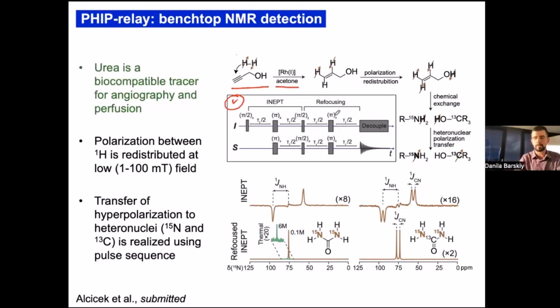After preparation of your target hyperpolarization, you can use phase transitions such as precipitation of your sample, degassing of your sample, or adding some extra solvents to solidify some of the materials and leave other chemicals intact. Then you can clean the solution if the lifetime of polarization in the solid state allows.